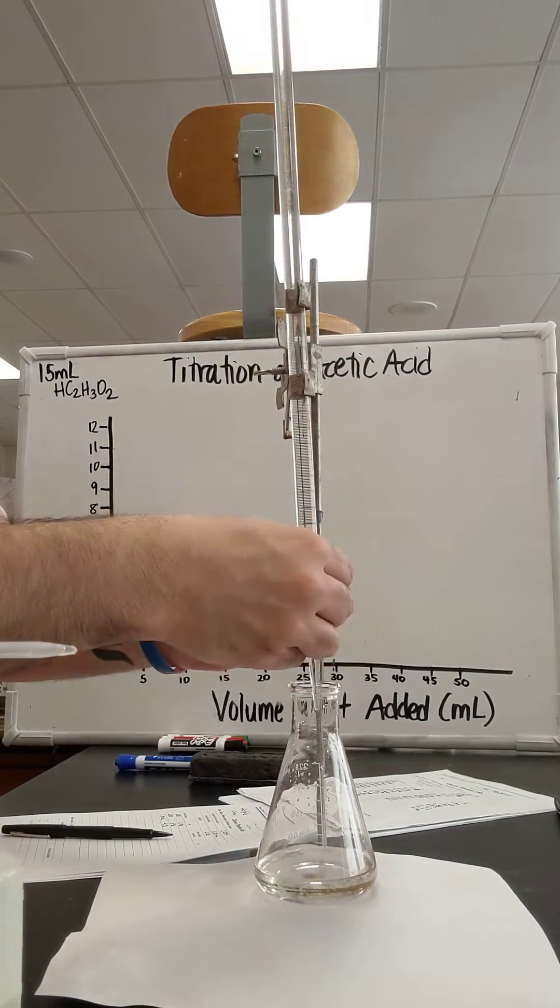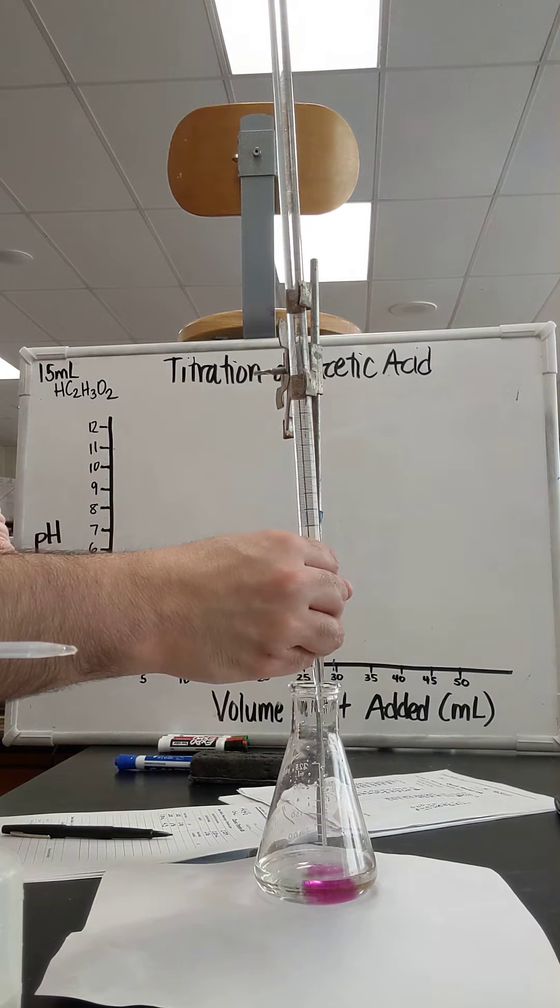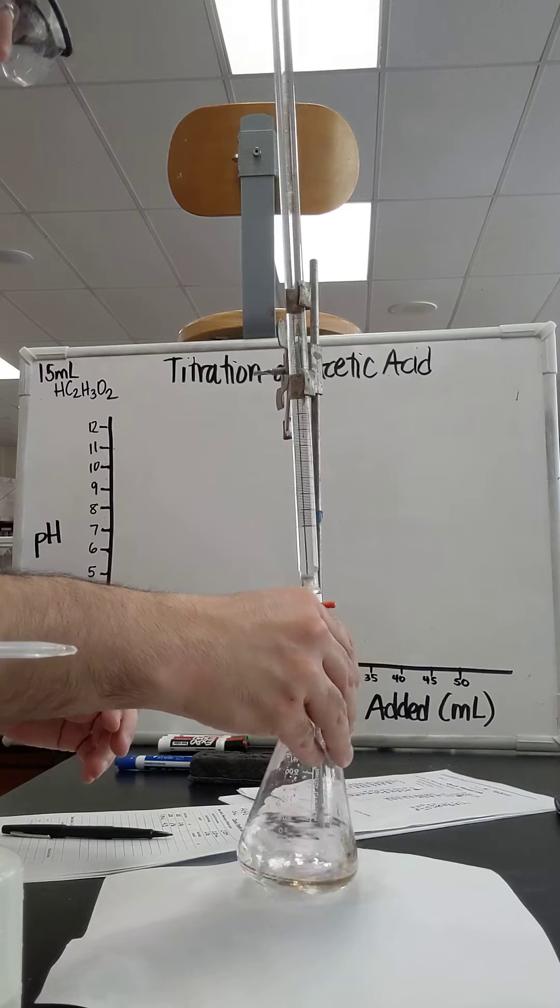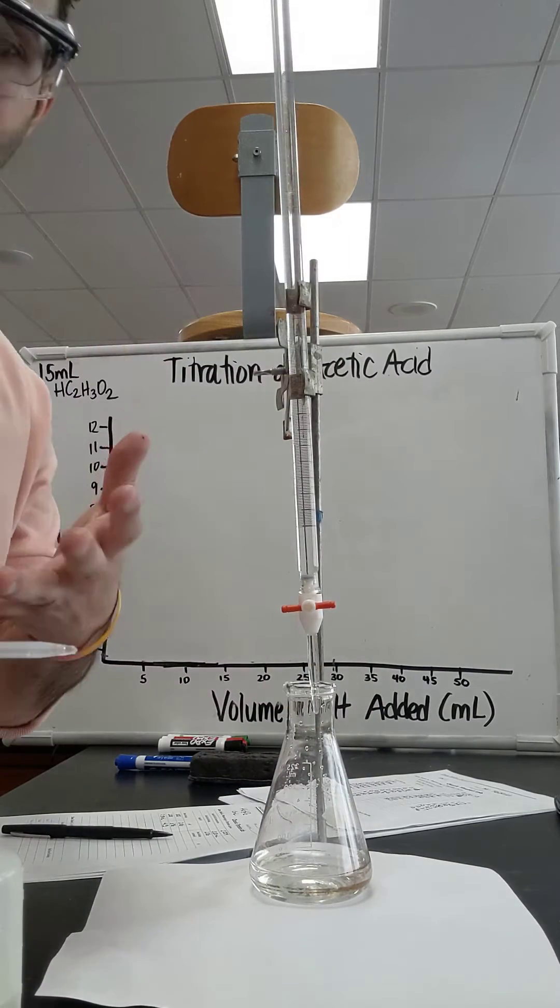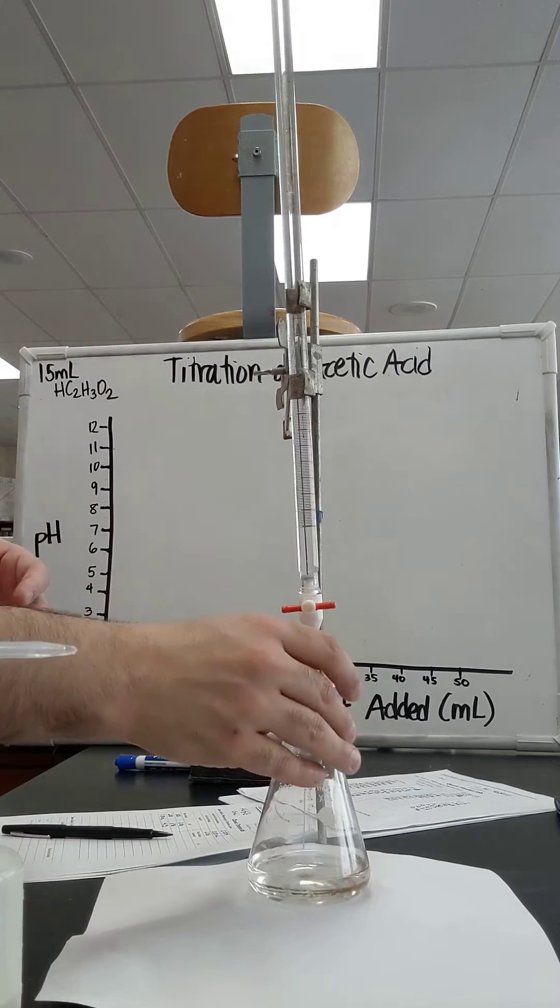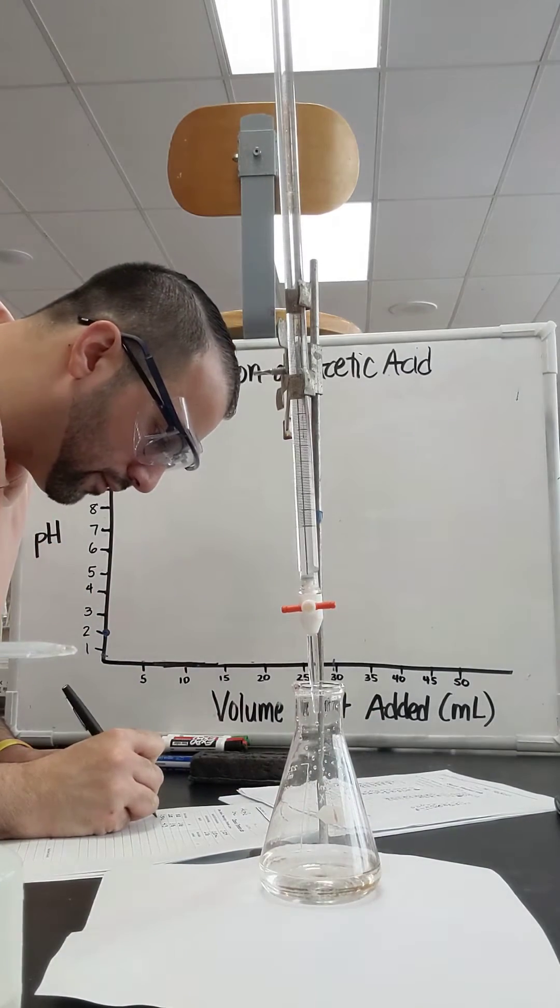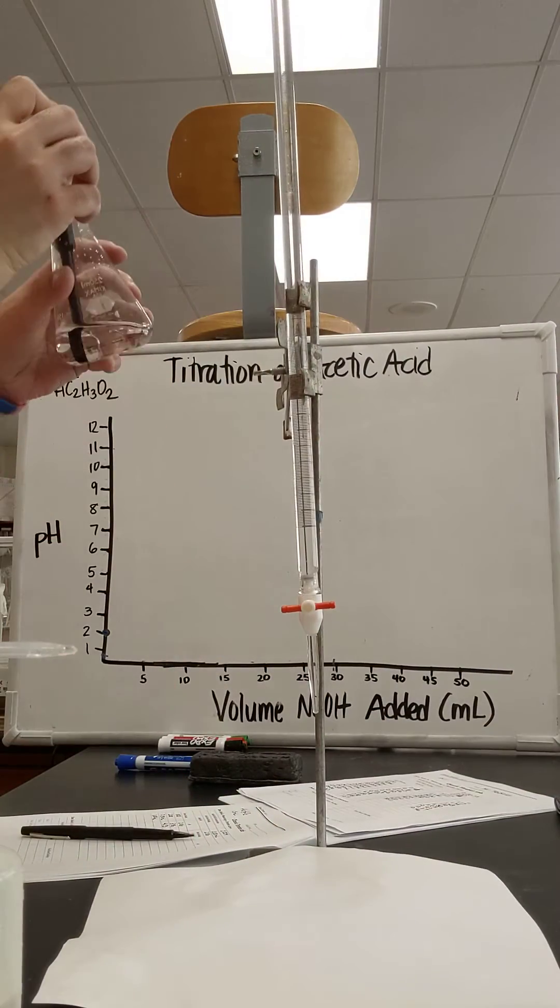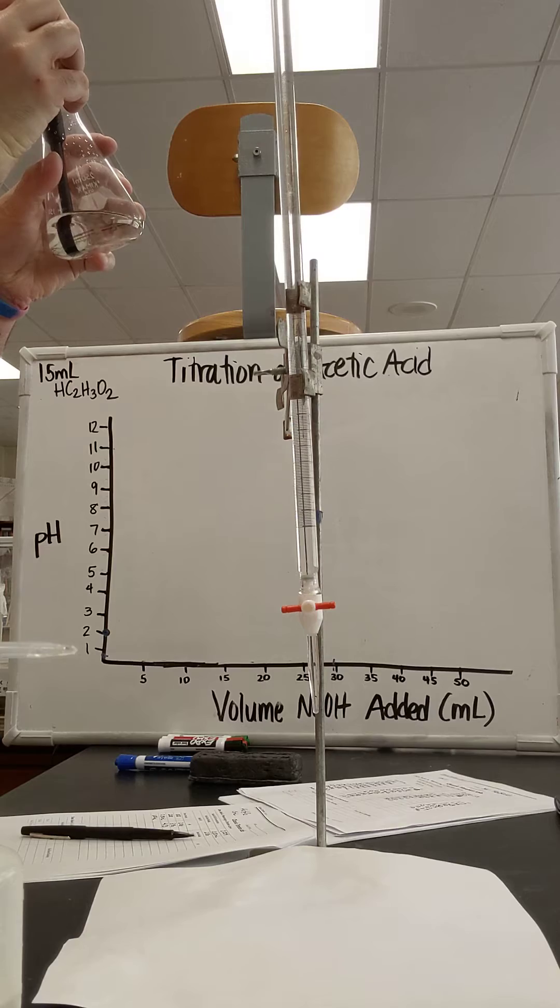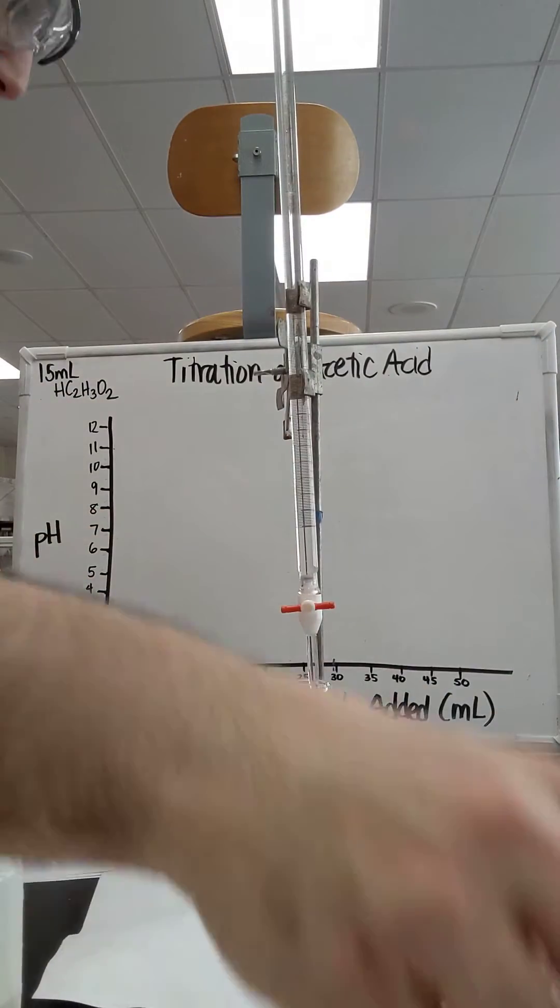I'm going to add another 0.5 in there. The technique is better if you kind of drop slowly, but I'm trying to make the video and doing it quickly. So I have 3 milliliters in here now. That pH then is, looks like it's 4.23.